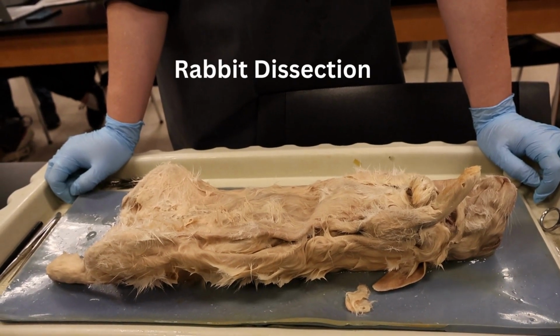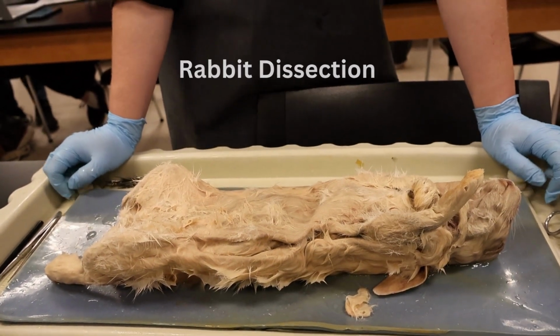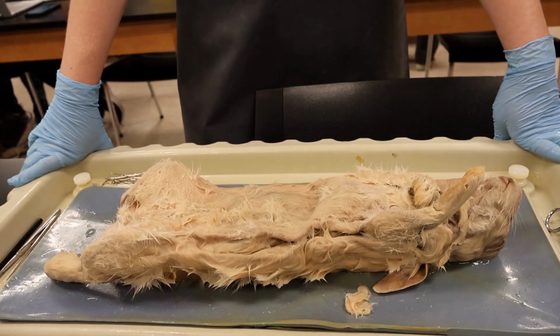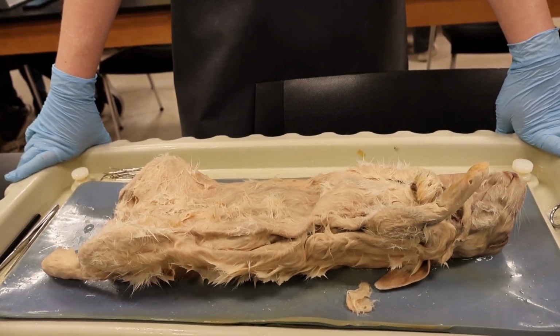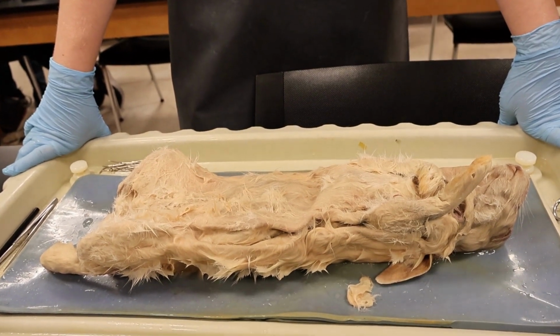Okay, so this is our animal dissection of a rabbit. This is our 1407 Biology for Science Majors 2 class with Professor Sher. Our team members are AlikBrisby, Shardae Sneed, Emily Corville. Okay, so this is our dissection of a rabbit.